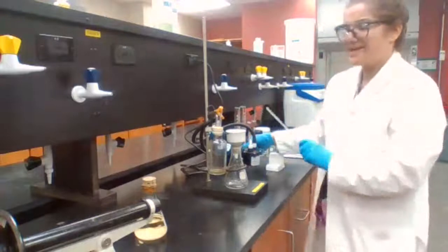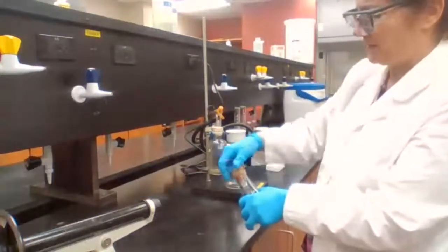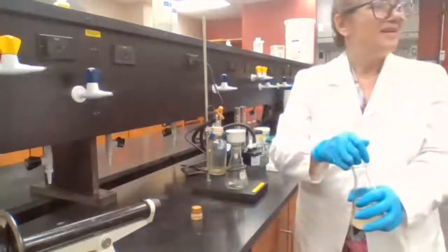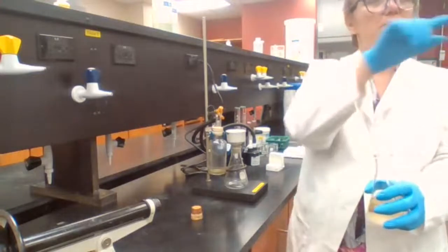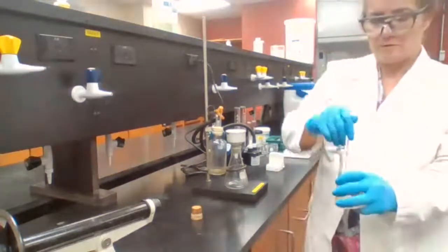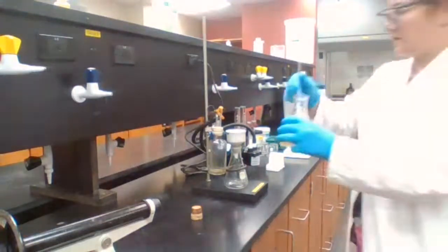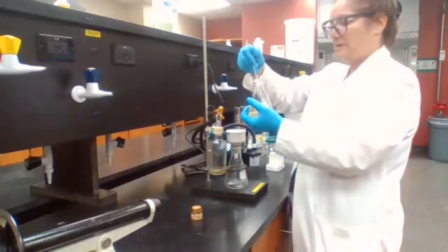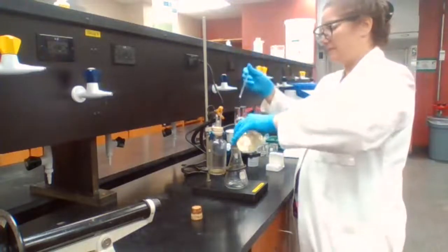I'm not measuring the mass of the product, so I don't have to measure the mass of the filter paper. Okay. So I'm going to turn on the vacuum and filter the crystals.